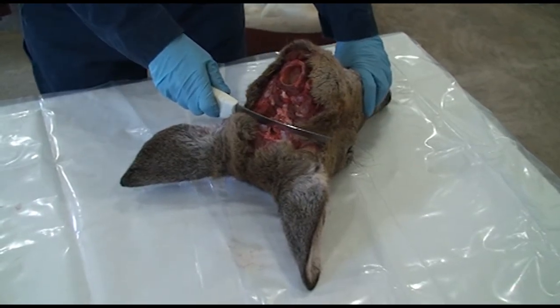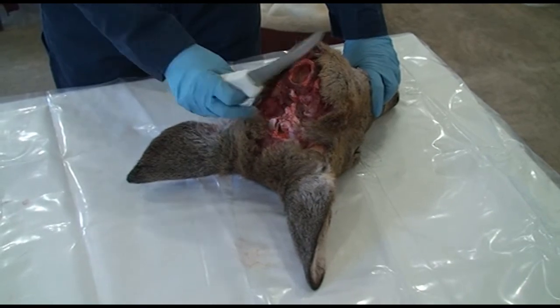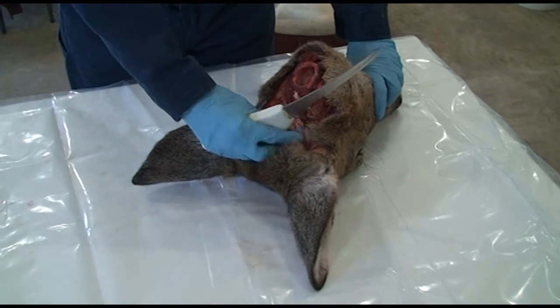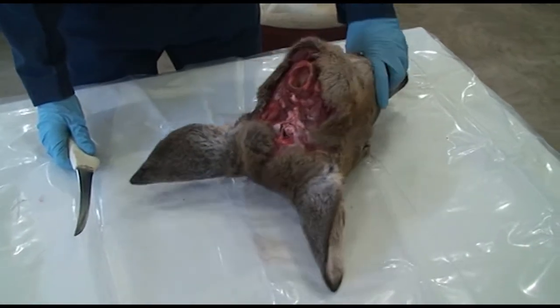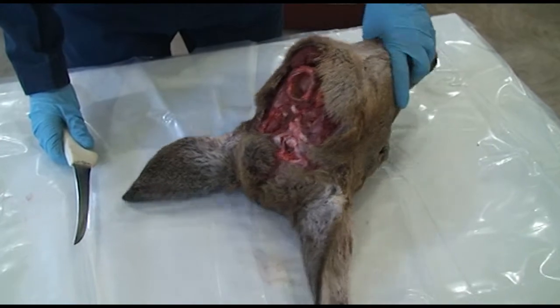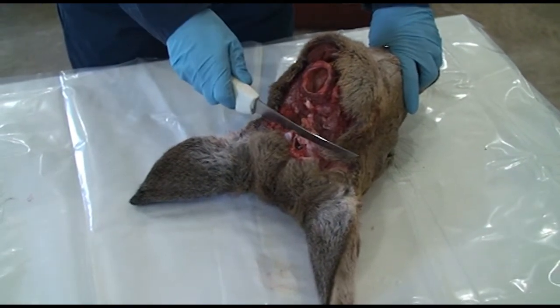And to know that you're in the right spot, because you're going to want to take this head off at the atlanto-occipital joint, the last joint from the spinal vertebrae to the head, to the back of the skull. The way you can check that is to move the head up and down while it's attached to the body, at your yes-no joint. Where that's going to bend is right where you need to take your knife down to cut that head off.